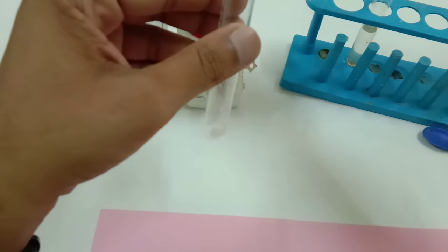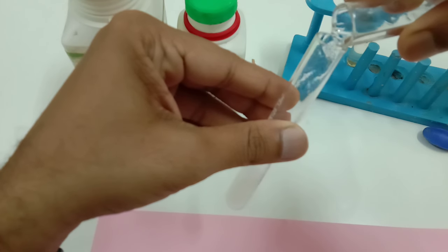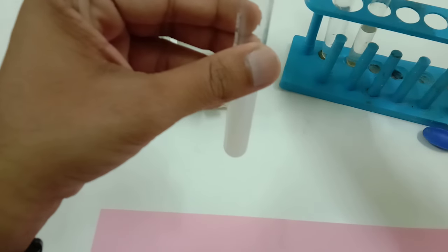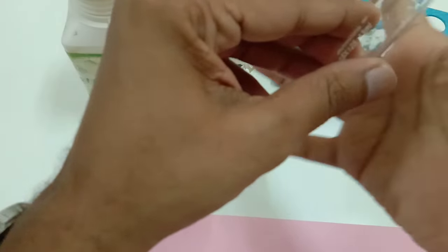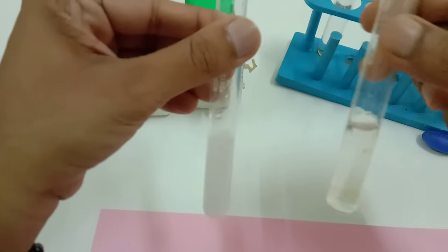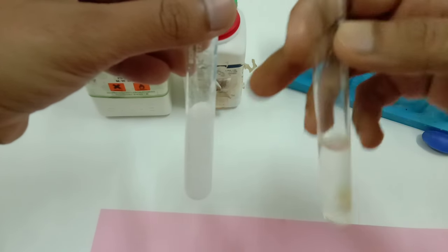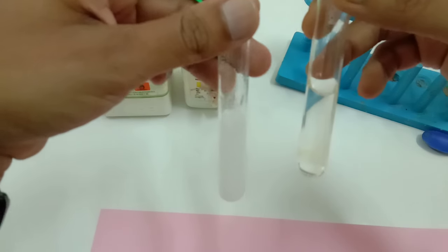Now this is Pb(NO3)2 powder, lead nitrate. I am going to add water in it, shake it well. Now Pb(NO3)2, this is the aqueous solution. This is the aqueous solution of potassium iodide.